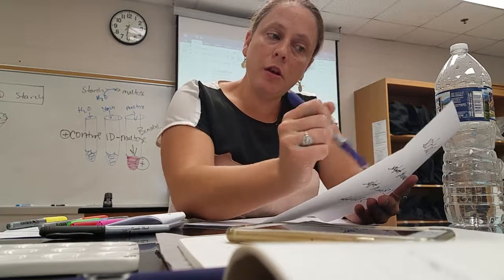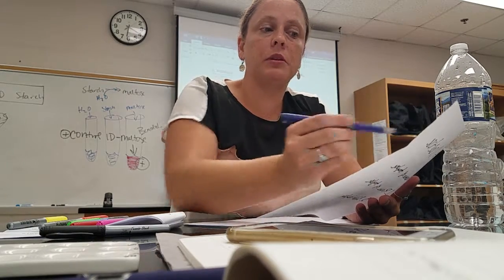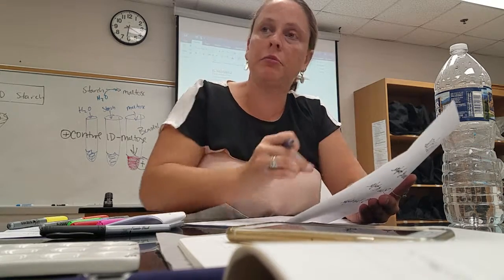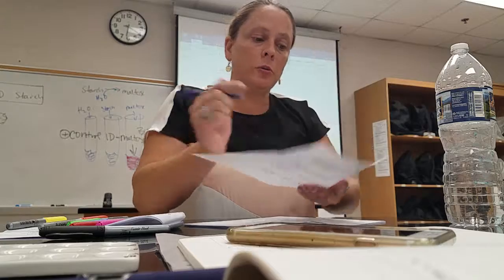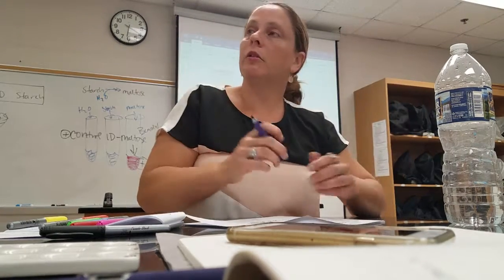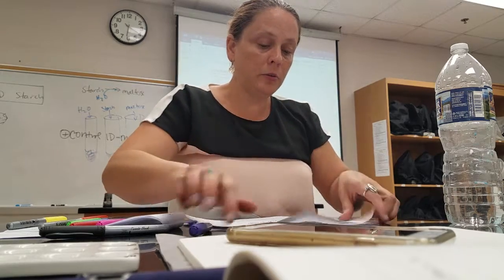Okay. We know what we're going to do with amylase. We don't need a reagent to detect amylase. We know what we're doing because we're putting them in 3 conditions. But what we don't know is how we're going to detect starch and maltose, and if it's just water. So we use reagents.